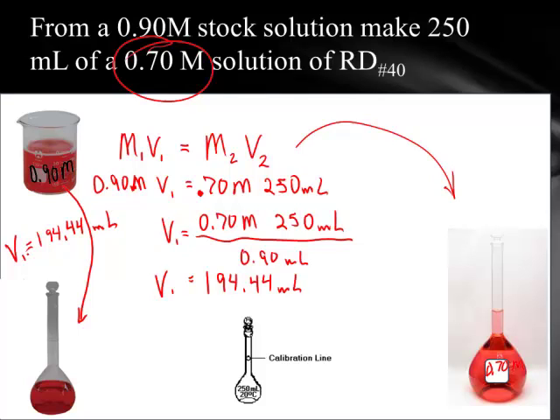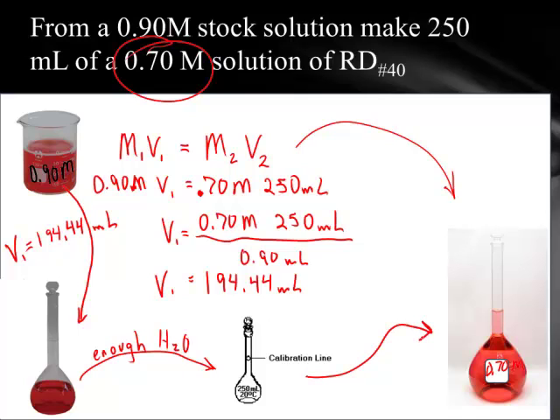I add that to this container. And then how much water do I add? I simply add enough water to bring my final volume up to the calibration line on the 250 milliliter volumetric flask. And what do I have? I have a 0.7 molar solution.